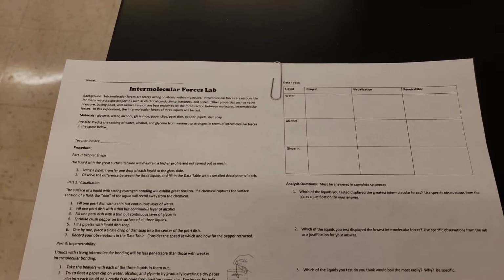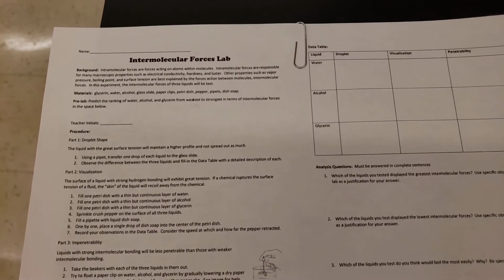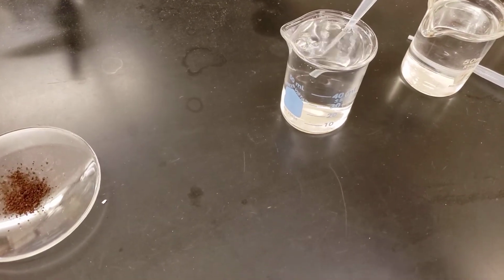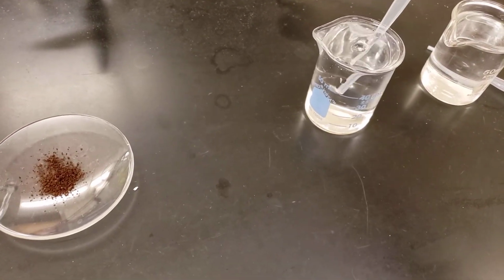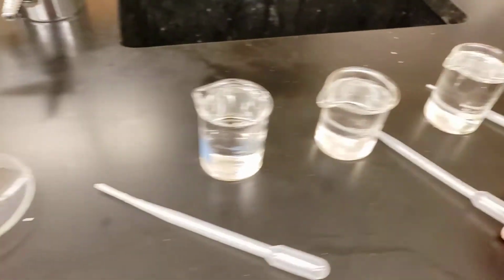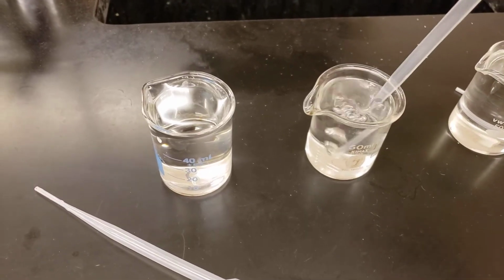Today we are going to be completing our Intermolecular Forces Lab. So up first, we are going to be judging droplet shape. We have water over here. We're going to take a pipette full of it, and we are going to put one drop on our slide. Then we are going to go over to our isopropyl alcohol, and we are also going to put one drop on our slide.